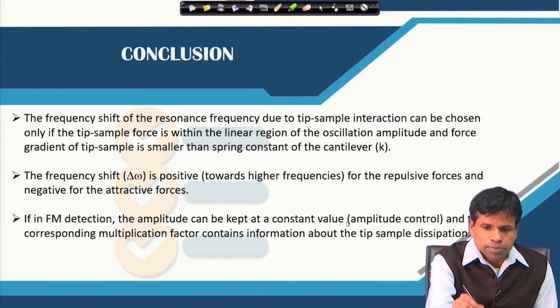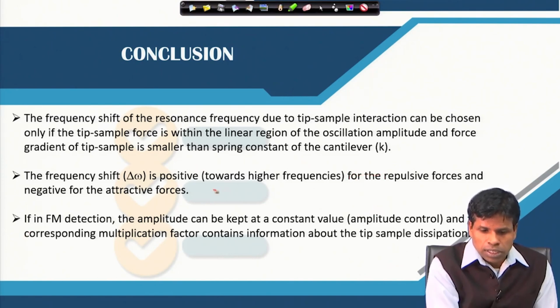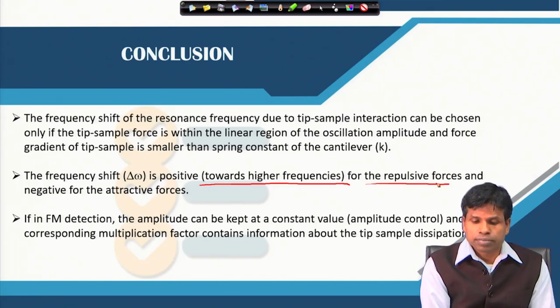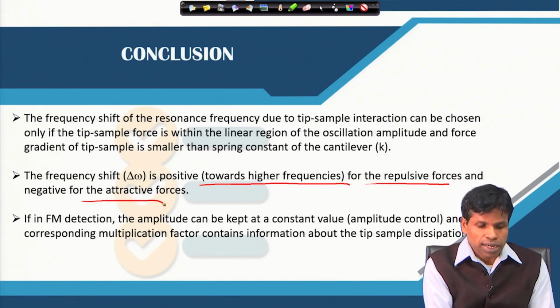The frequency shift is positive, towards higher frequencies, for repulsive forces and negative for attractive forces.